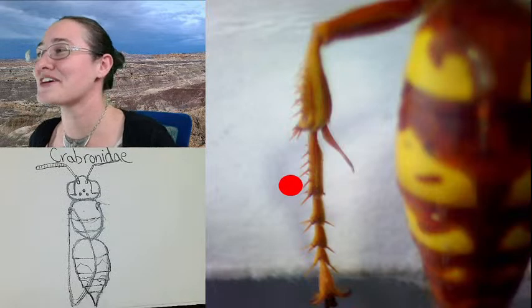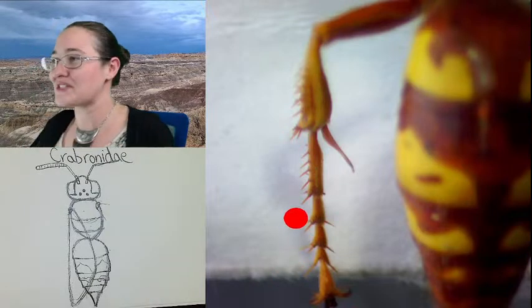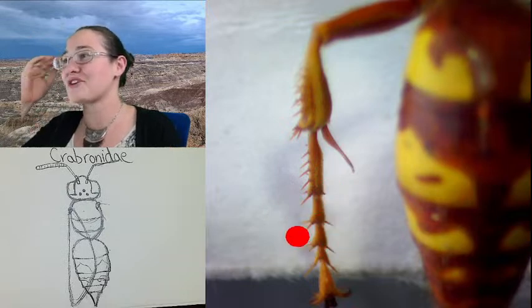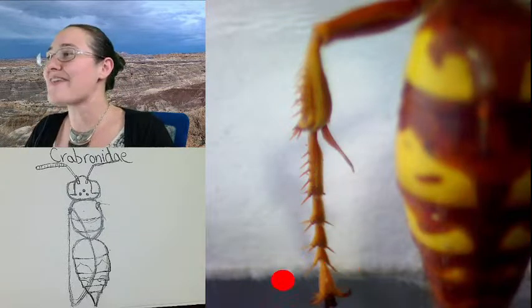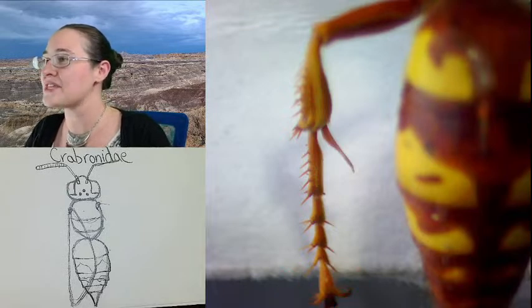It is two spurs. And then you have all of these tarsal segments, and all of these tarsal segments also have these kind of aggressive-looking spines. At the end of the legs, you've got these two tarsal claws and these two pads.